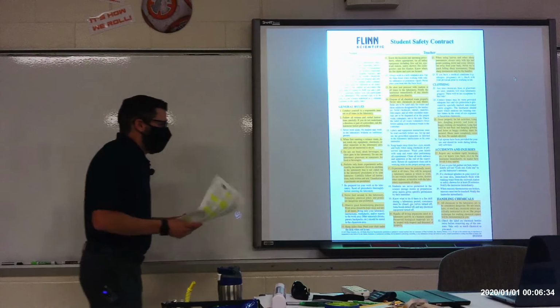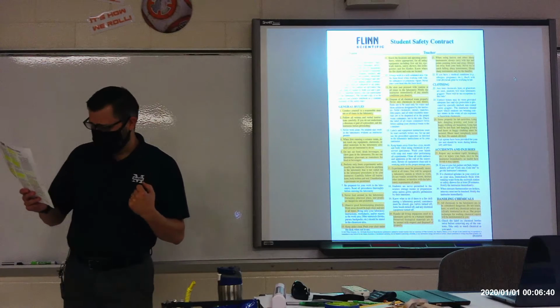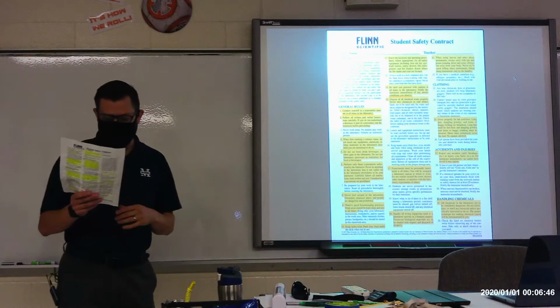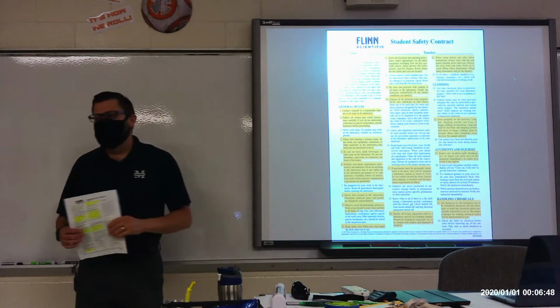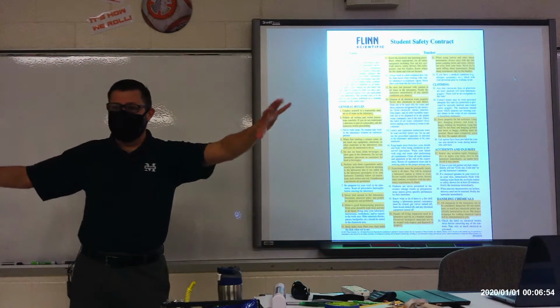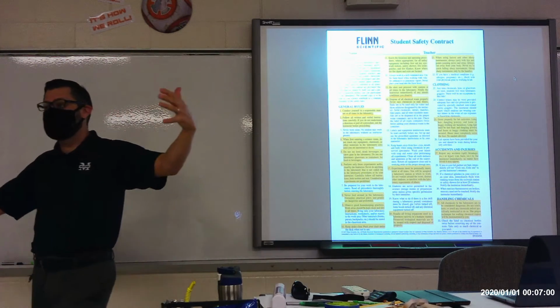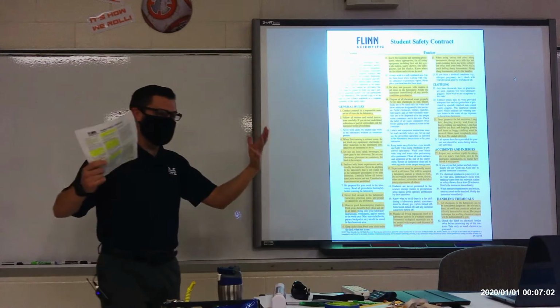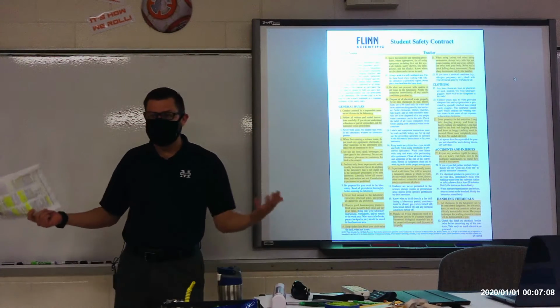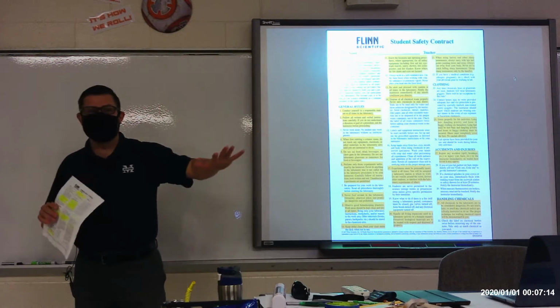Okay. All right, item number 3 doesn't really apply to us, but number 4, when first entering a science room, do not touch any equipment, chemicals, or other materials in lab area until you are instructed to do so. When you walk in, I may have equipment already set up, and in some cases I spent all morning or sometimes the afternoon previous setting up that equipment for this lab. So if you walk in and immediately start playing with whatever's sitting out, you might undo that hour or more of me setting stuff up. So please just leave everything alone until I tell you to do so.